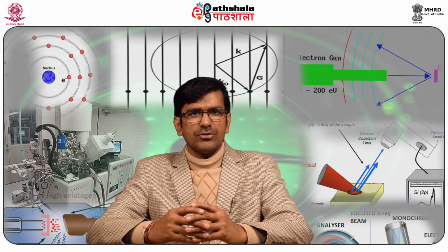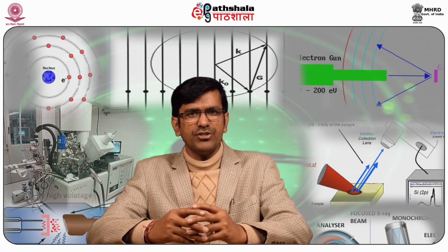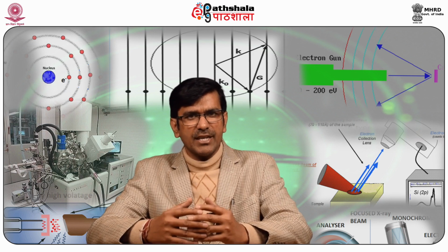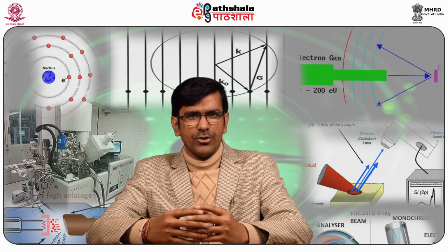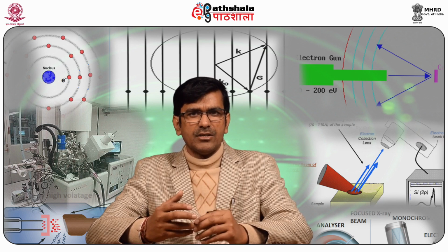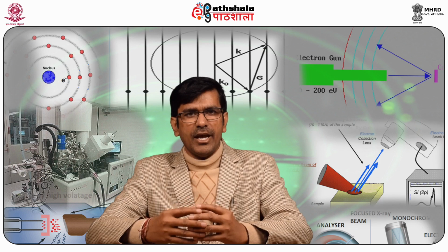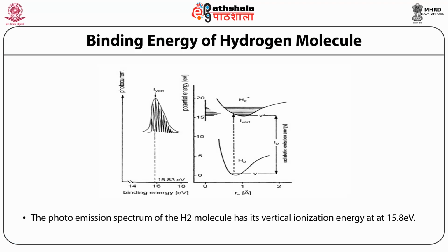The DuPont curve resolver, which uses analog circuitry, has been used effectively. Its function is in evaluating a variety of parameters. Its weakness lies in the lack of an objective criterion for the goodness of the fit. Mathematical methods have been discussed for the deconvolution of the data, with particular concern for data encountered in X-ray photoelectron spectroscopy.